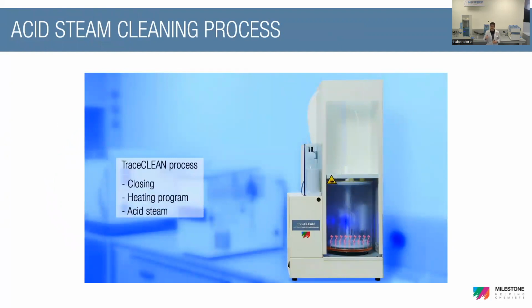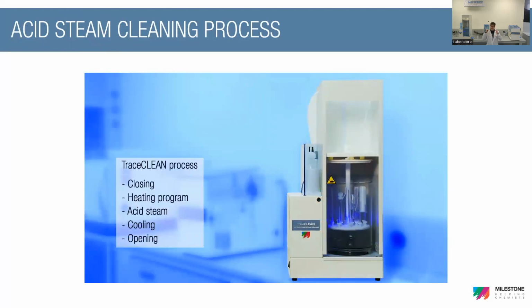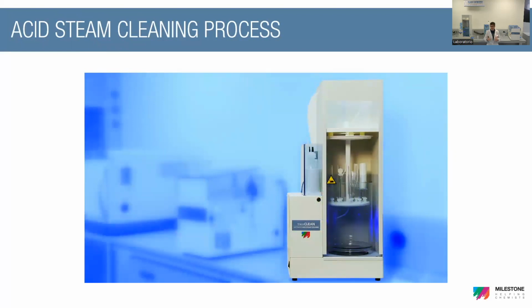The acid is heated up by a heating element to produce pure vapors that go up until they reach the glassware to be decontaminated.